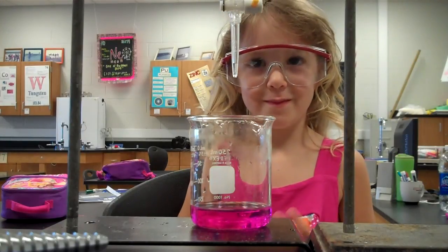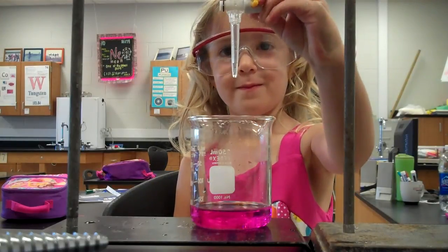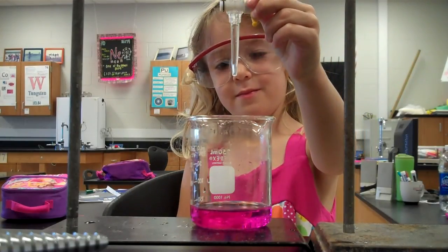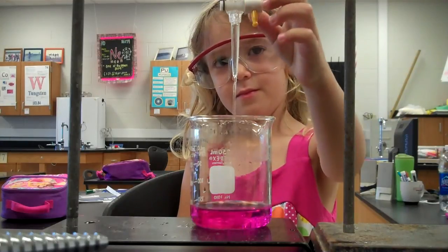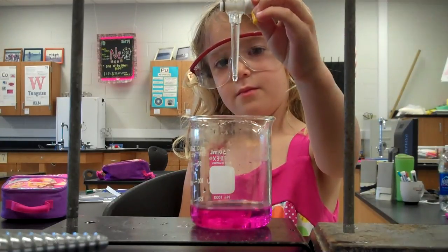Now go ahead, let's try to change its color. Careful now. There you go, that's good. Wait — turn it off a little bit, that's too fast. There you go. Perfect.